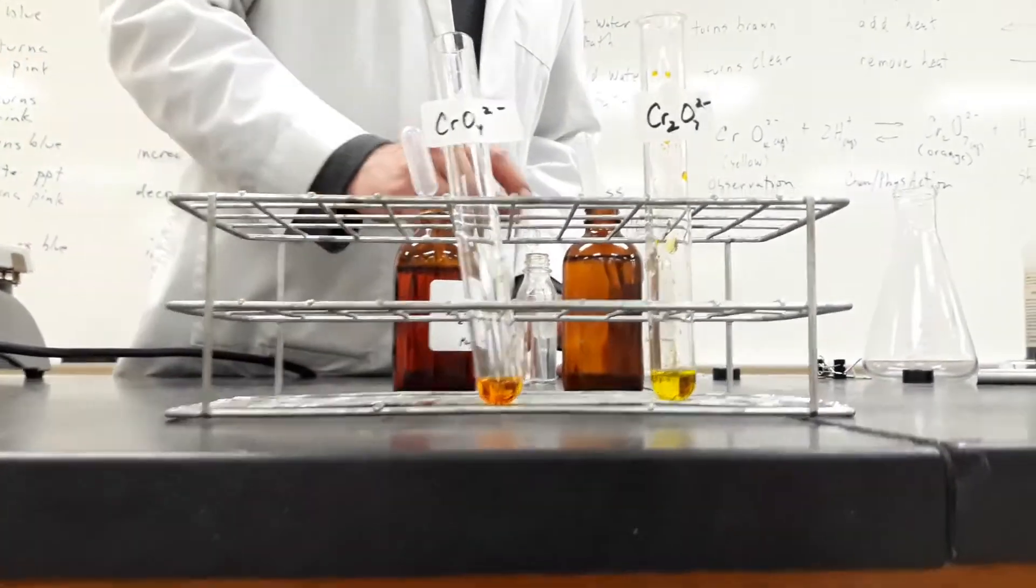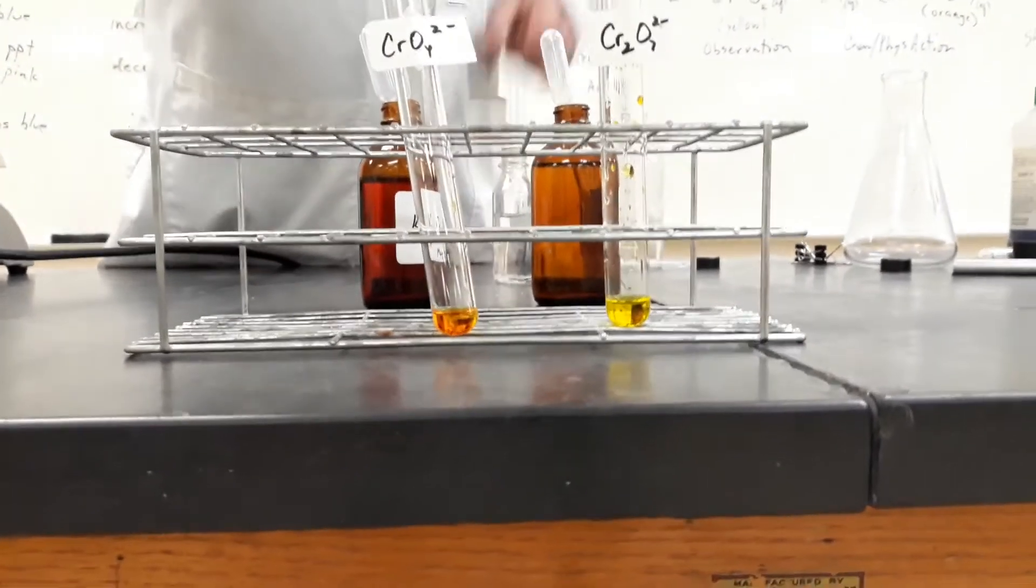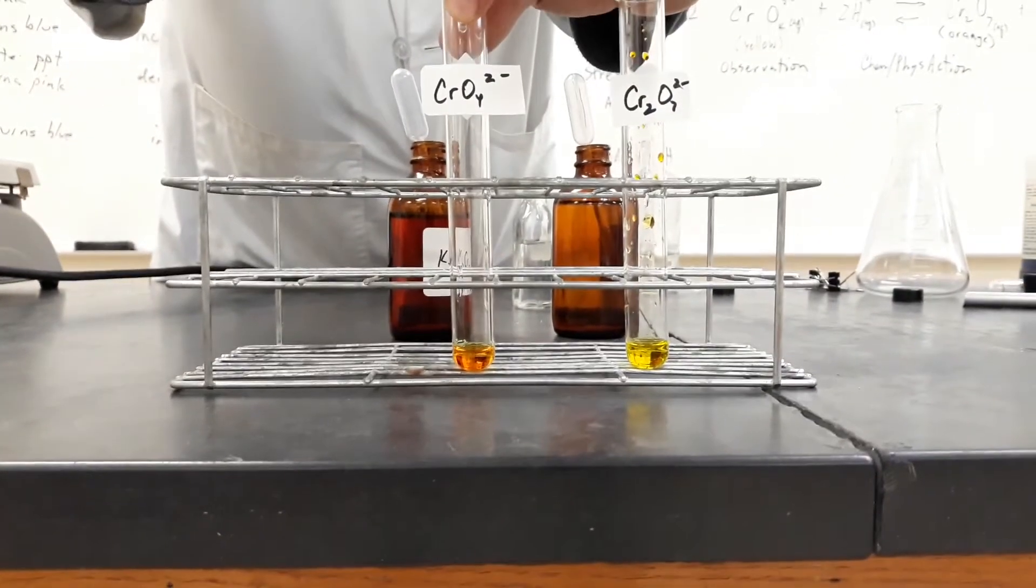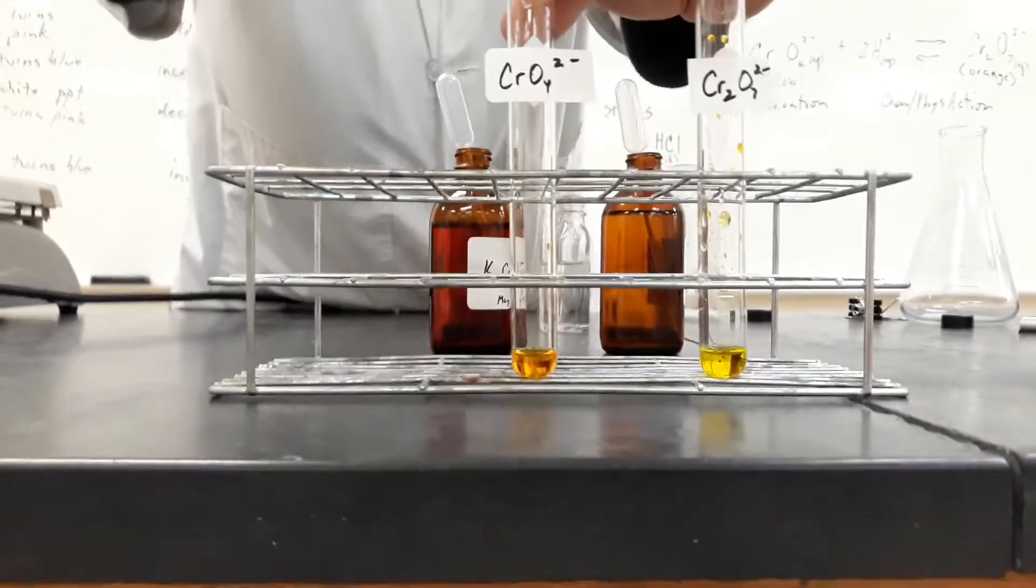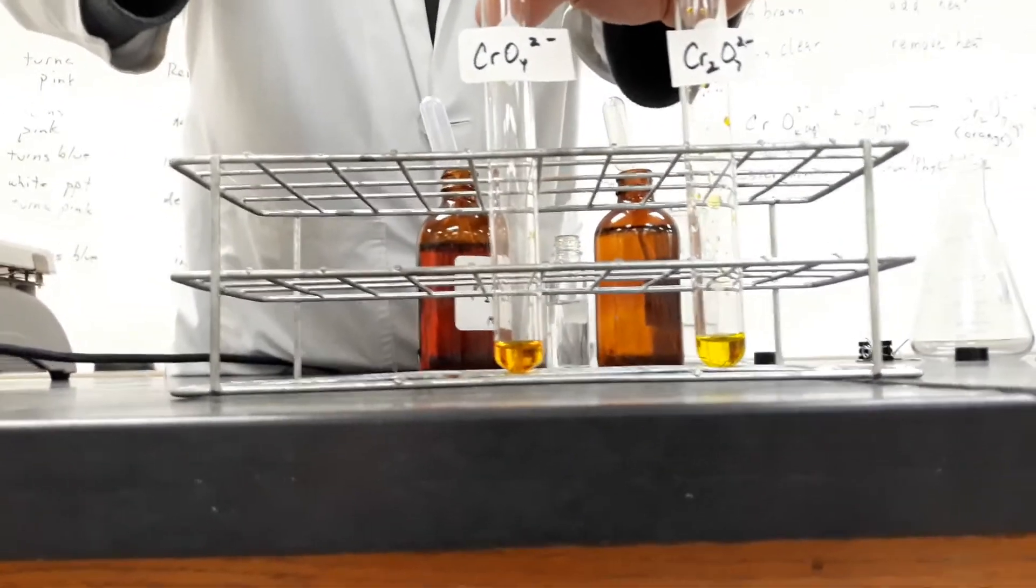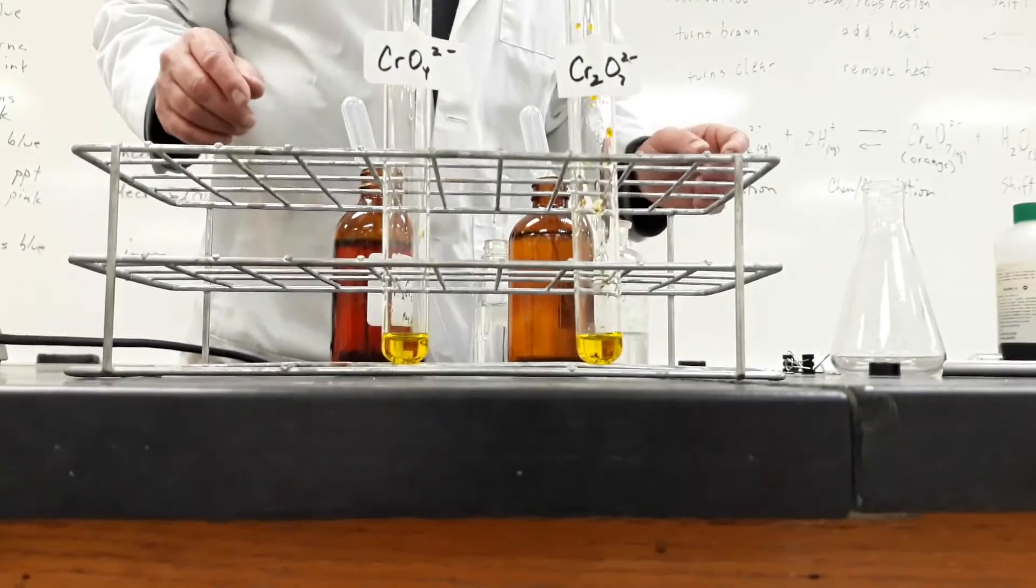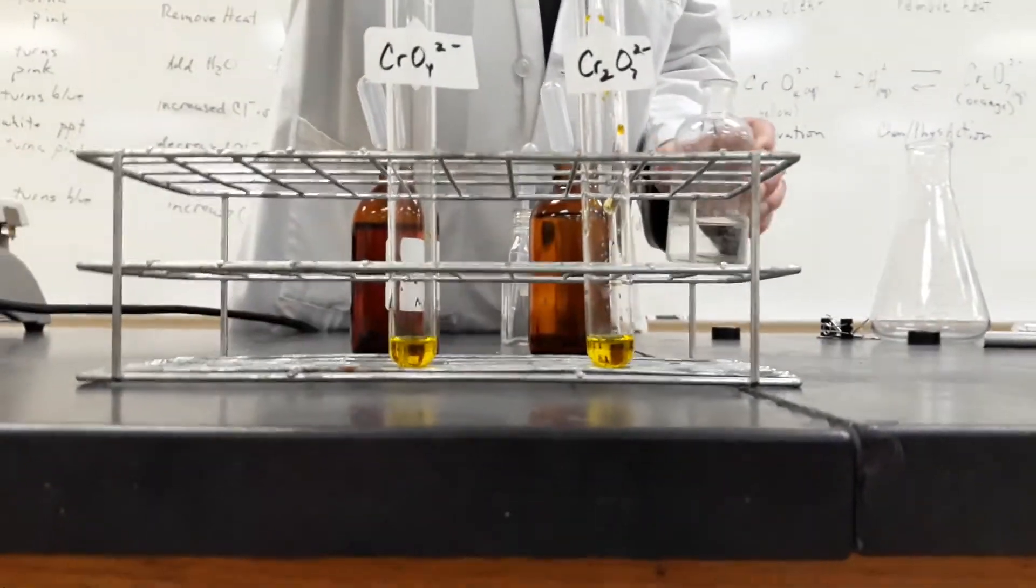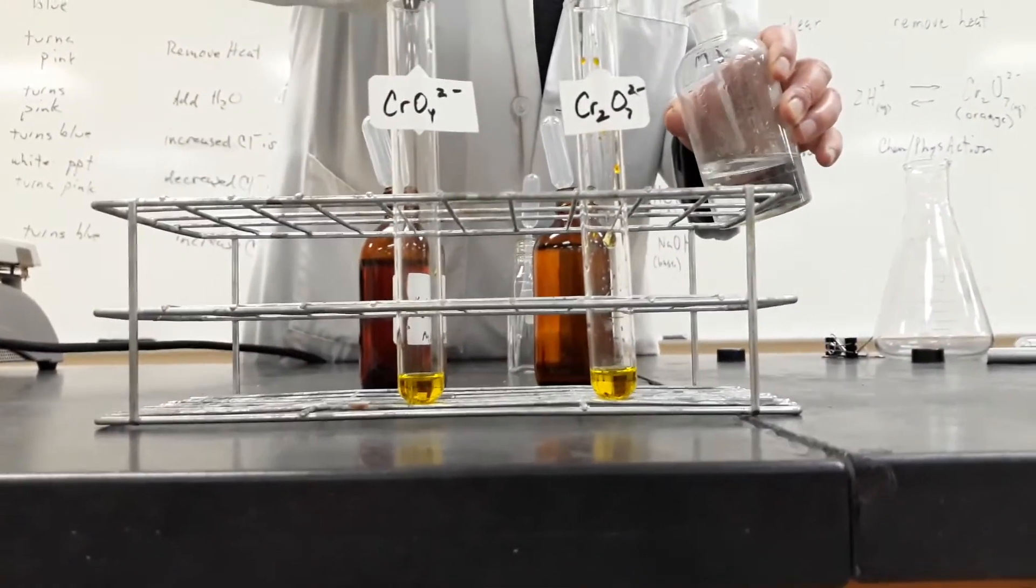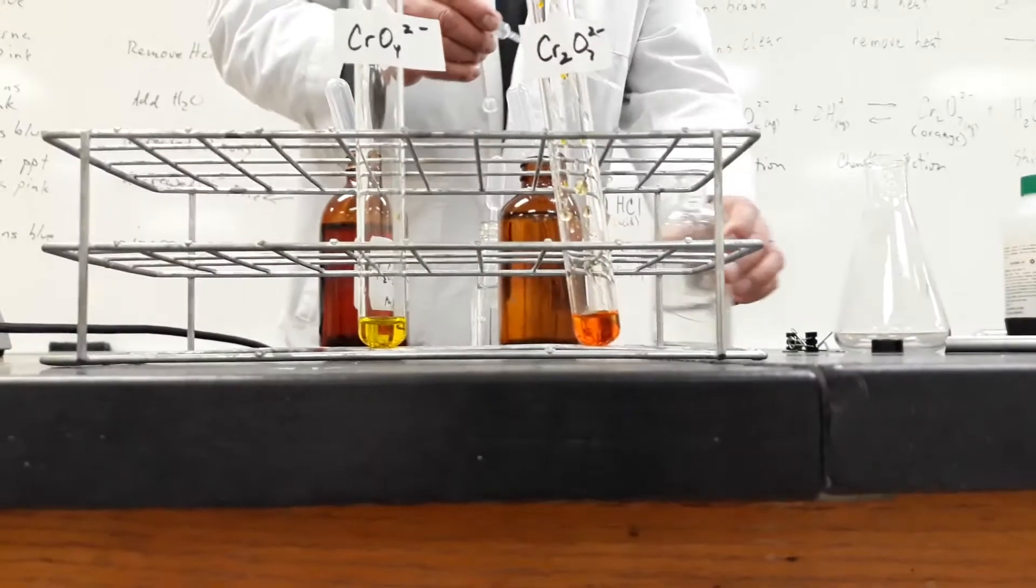Now you might be thinking, can we go back the other way? So I'll add sodium hydroxide to this one. And it turns yellow. And sulfuric acid to the other one. And it turns back to orange. So you can shift equilibrium multiple times back and forth.